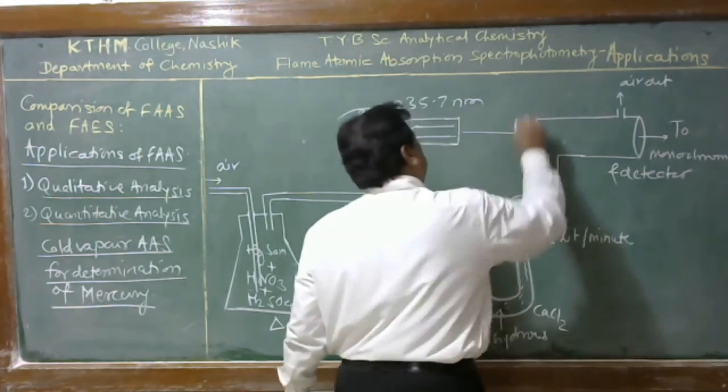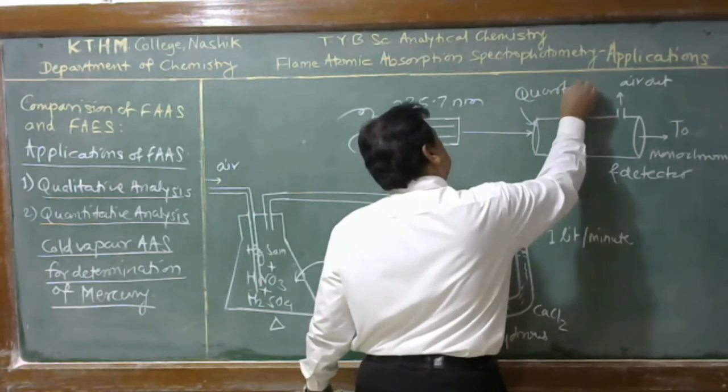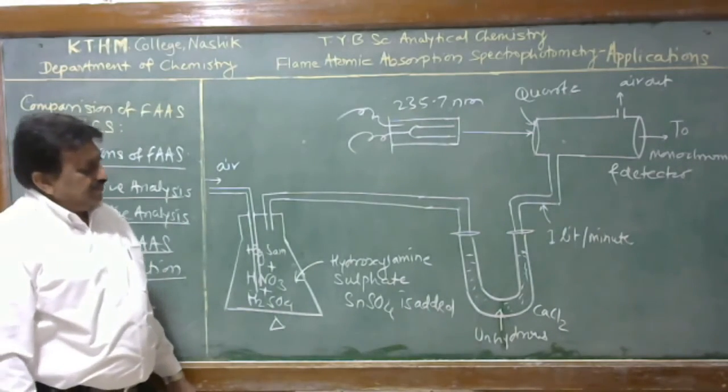This is a quartz window because these UV radiations are passed only through the quartz cell.